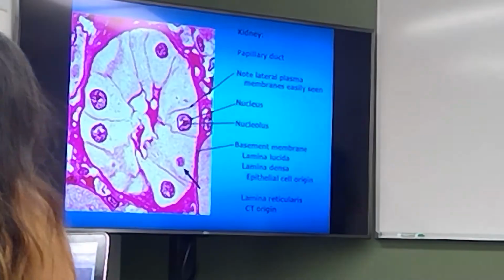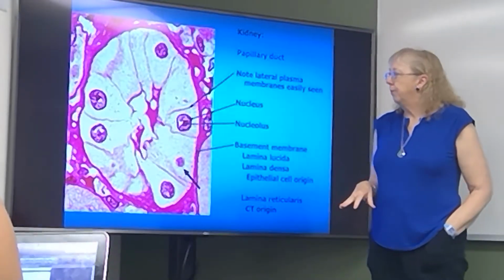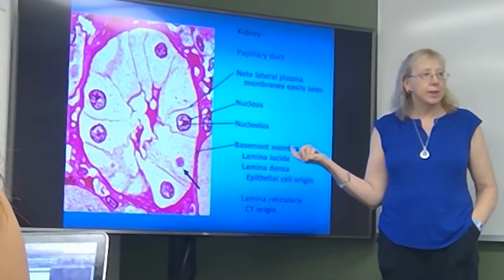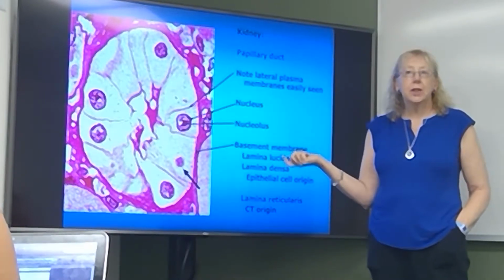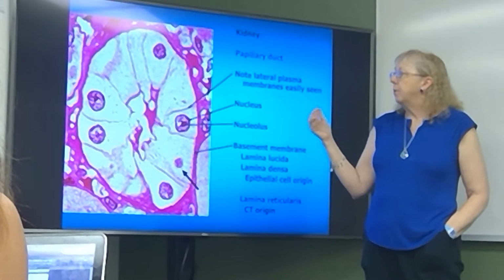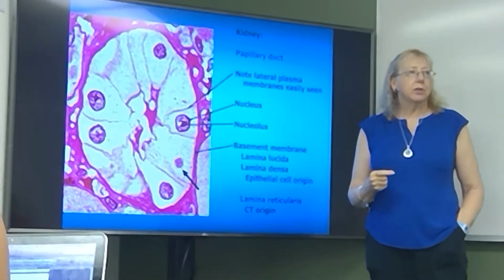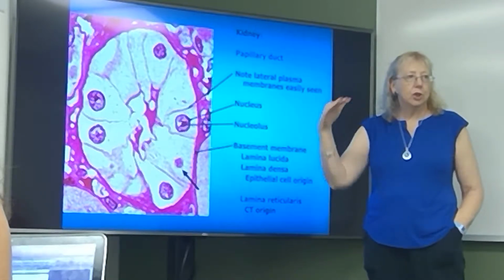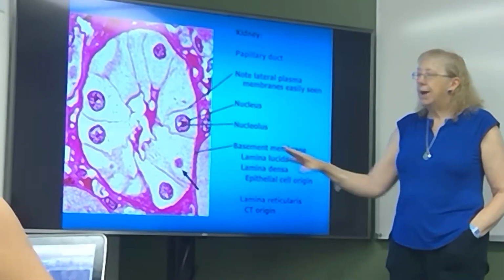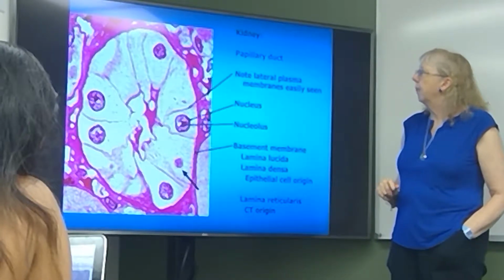Another example, these are cells. They are prepared by embedding the sample into plastic, which can then be sectioned with a glass or diamond knife and made into a thinner section. The thinner you make your section, the fewer cell layers you have to look through that may be laying on top of one another. So plastic sections are really nice to be able to see all the features clearly.